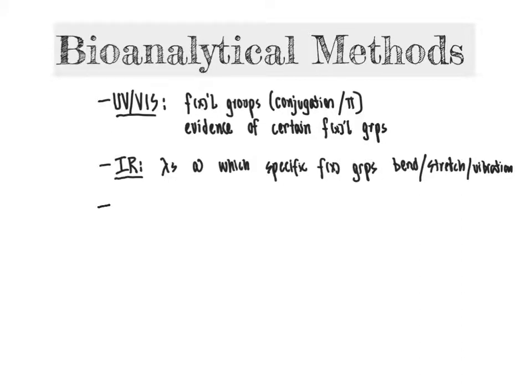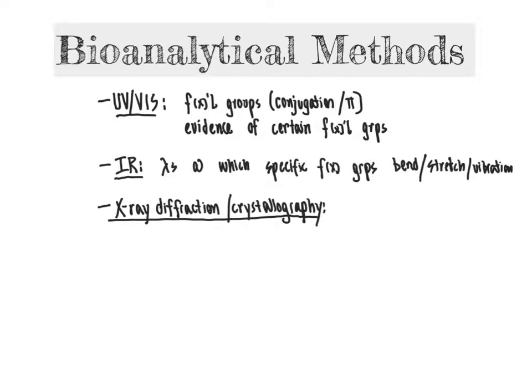So another piece of the molecular puzzle that we can use to determine the structures of organic molecules is X-ray crystallography, or X-ray diffraction. In X-ray crystallography, what we do is create a crystalline structure of our molecule of interest, and then we subject it to X-rays and measure the resulting diffraction pattern, which gives us information about the electron density of the molecule, and from that information about electron density, we can infer the spatial location of atoms, since atoms are going to be in regions with electron density, since the electrons are there within the atom.